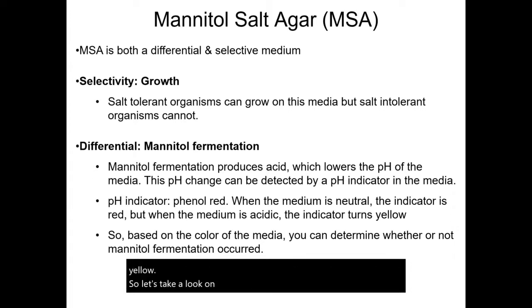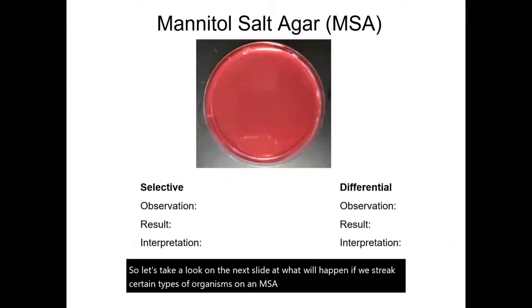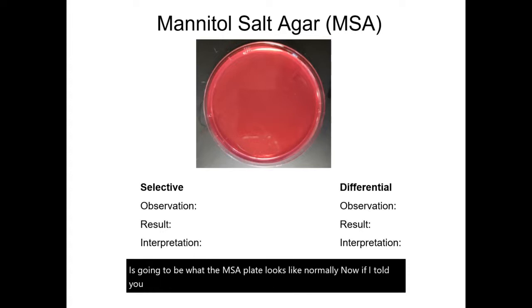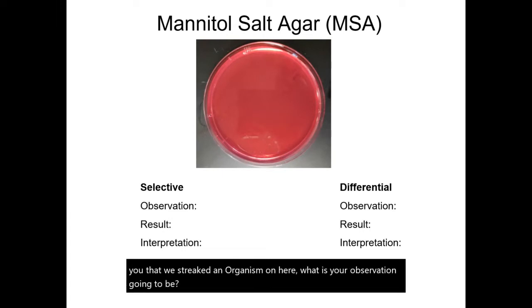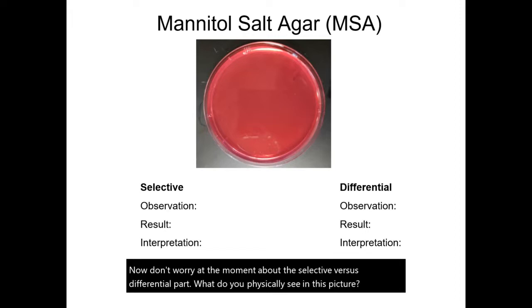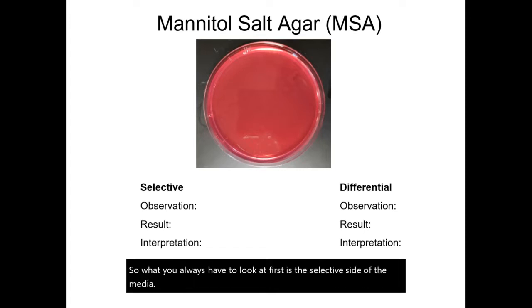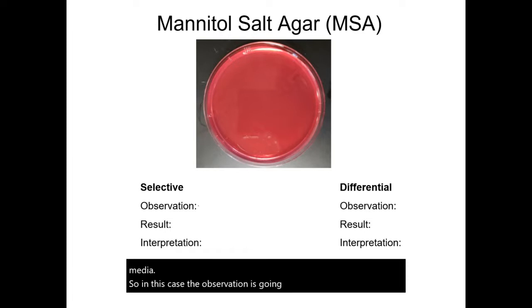Let's take a look at what happens when we streak certain organisms on an MSA plate. This first plate is what MSA looks like normally. If we streaked an organism here and you see absolutely nothing — there is no growth — you always have to look at the selective side of the media first. In this case, the observation is no growth.